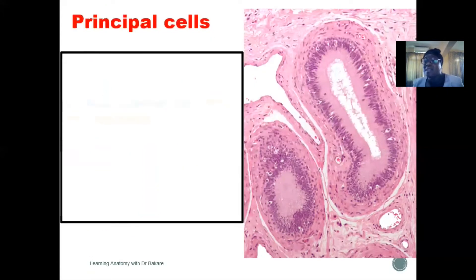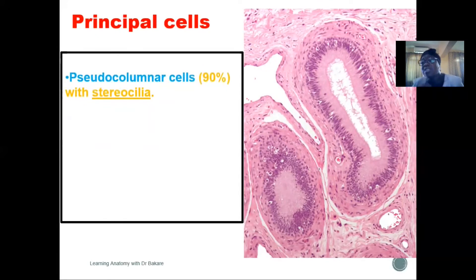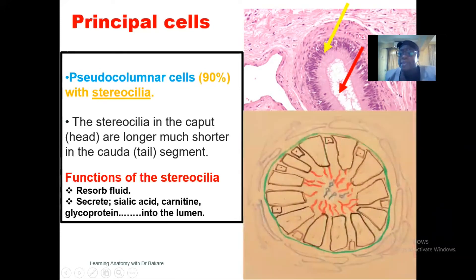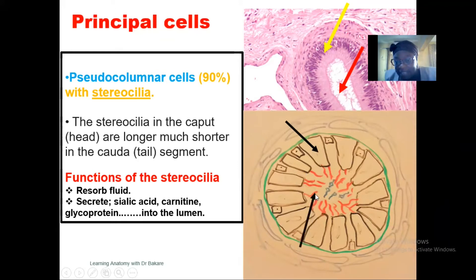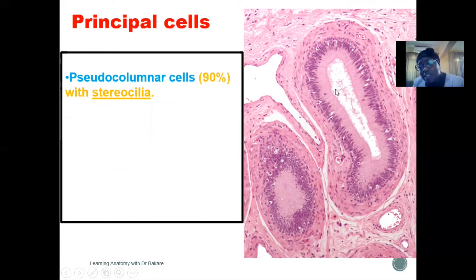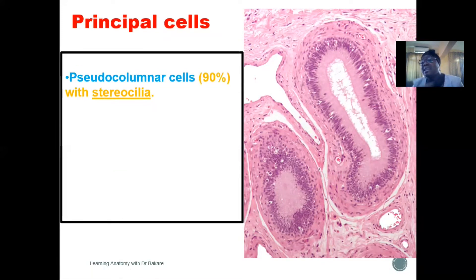Let's take the principal cell first. The principal cell is the major secretory cell of the epididymis. They are seen as a pseudo-columnar type of epithelium. Highlighting the principal cell in the handmade diagram, these are pseudo-columnar type of cells whose free surfaces are seen with stereocilia — directed towards the lumen. Within the epithelium lining the epididymis, the principal cell takes about 90% of the cells seen within the lining.